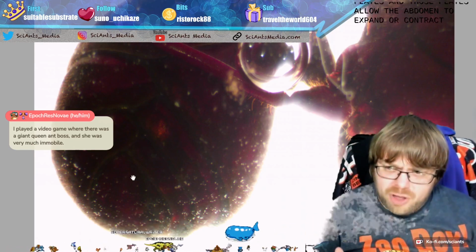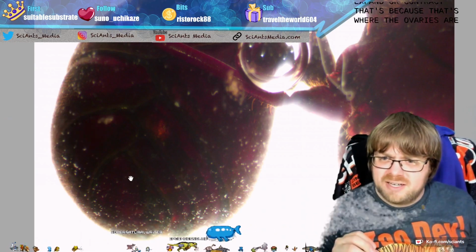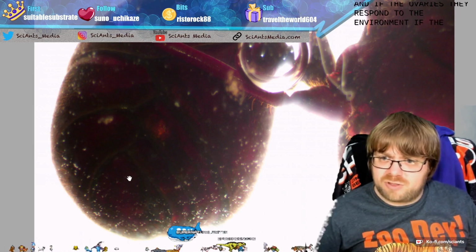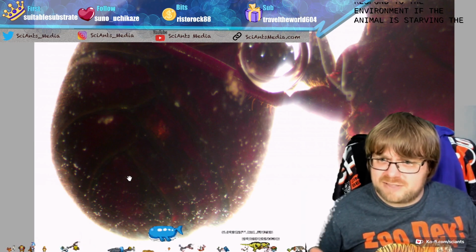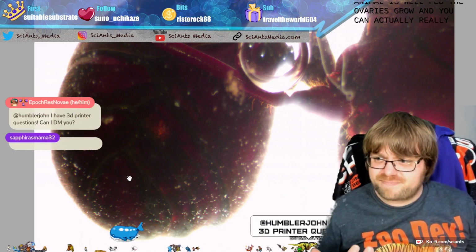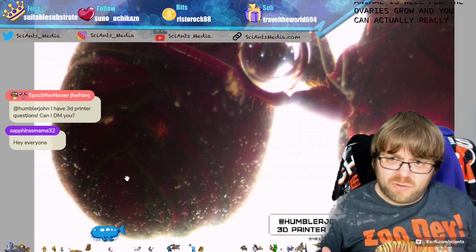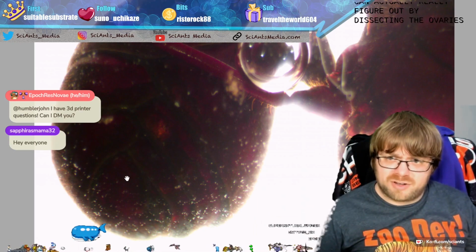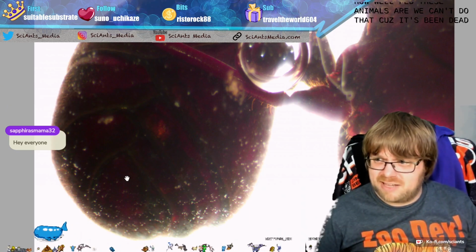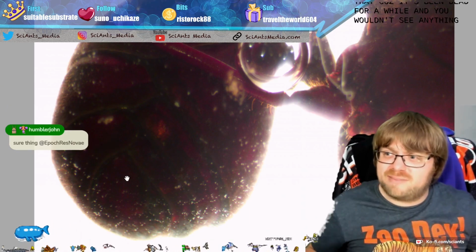That's because that's where the ovaries are, and the ovaries respond to the environment. If the animal is starving, the ovaries shrink. If the animal is well fed, the ovaries grow. And you can actually really figure out by dissecting the ovaries how well fed these animals are. We can't do that because this has been dead for a while and you wouldn't see anything, but that's a neat thing to be able to do.